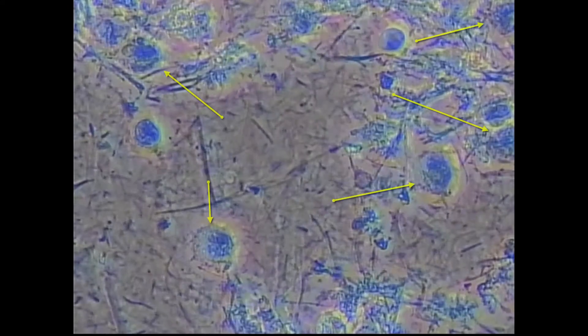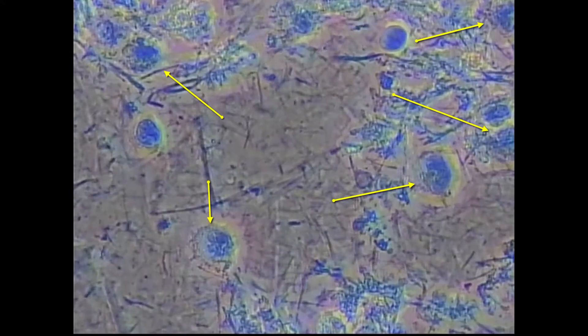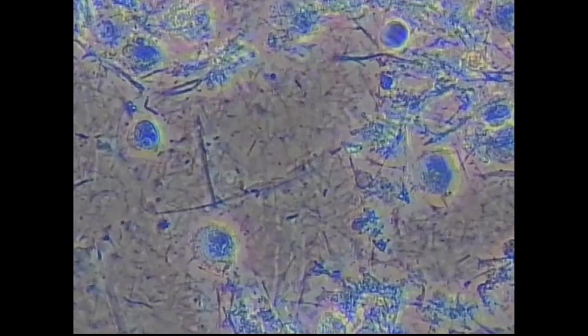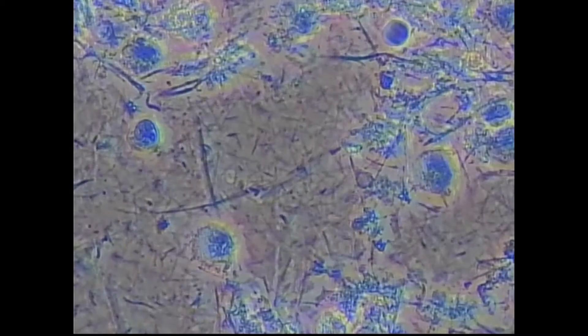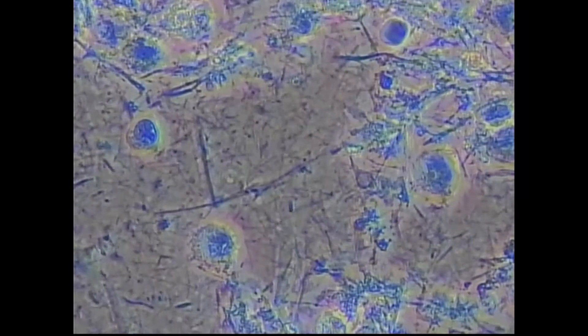You have large PMNs that are mounting an immune response to the infection, and the corkscrew-like bacteria that's moving, or the actual spirochetes that are infecting his mouth.